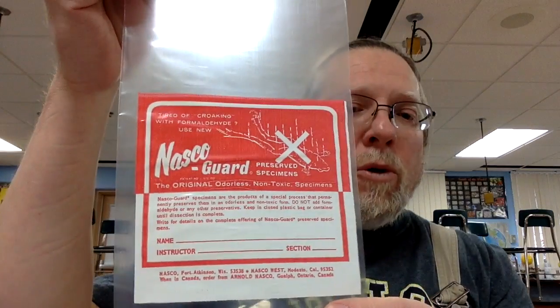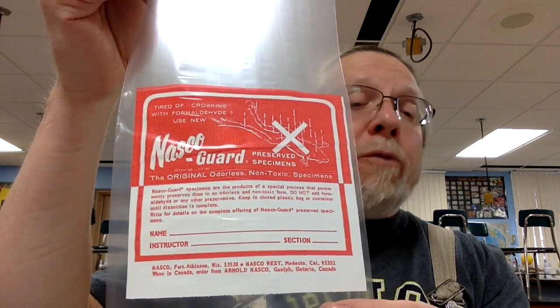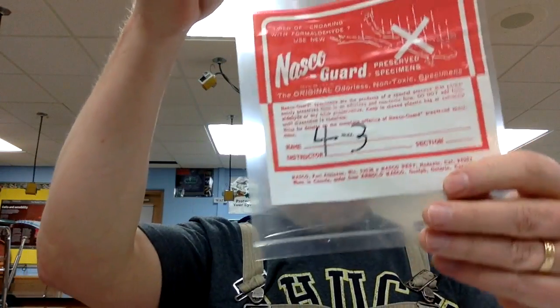As with many other things in science, labeling will be important. You've been given a little baggie that will contain your frog, and right now I just would like you to label it with your table number. So if I were in period 4, table 3, I would use a Sharpie and label my bag clearly as 4-3. This helps me stay organized — I'll keep all the period 4 frogs in one area so we can have them ready for you when you show up for class.